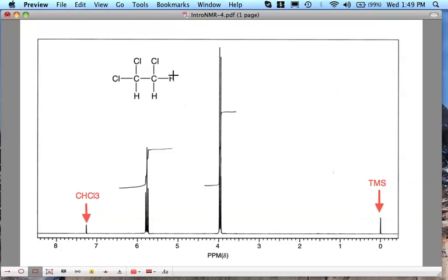So if we have these hydrogens equivalent to each other, it turns out that they don't split each other, but they are split by non-equivalent neighbors. And what do we mean by a neighbor? Typically that's something that's 2 or 3 bonds away. So if I look at this hydrogen, there's 1 bond, 2 bonds, 3 bonds from that neighbor. So it will typically be split by it.